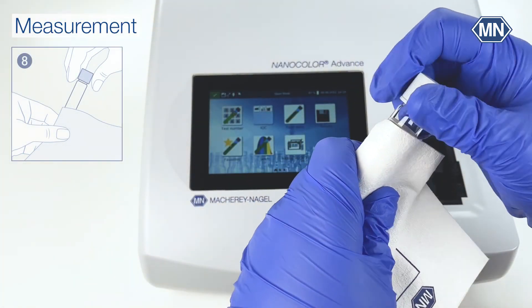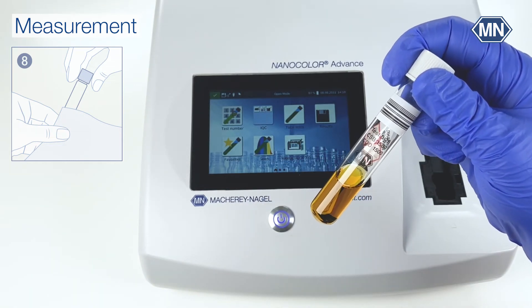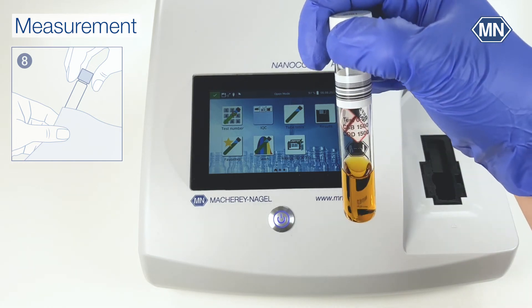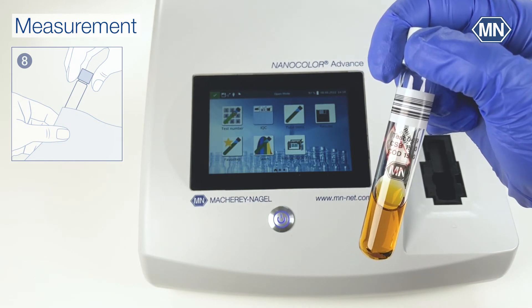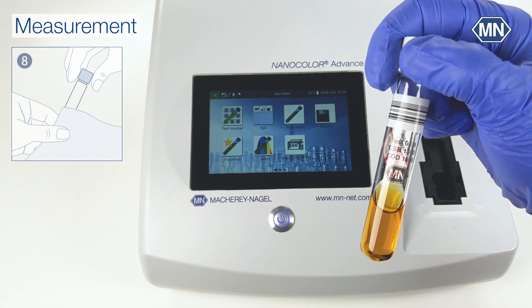Clean the test tube thoroughly. Be careful not to shake the test tube while cleaning. Check the test tube for turbidities — the tests are sensitive to turbidities. Make sure to have the NTU check always activated to prevent wrong results because of turbidity.